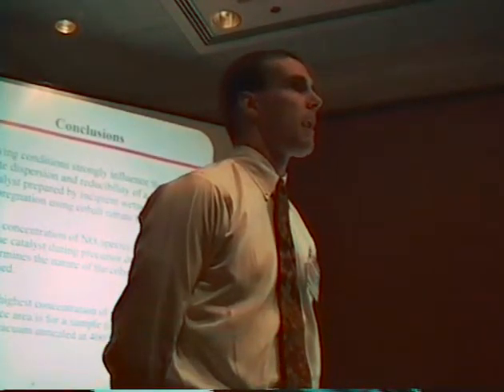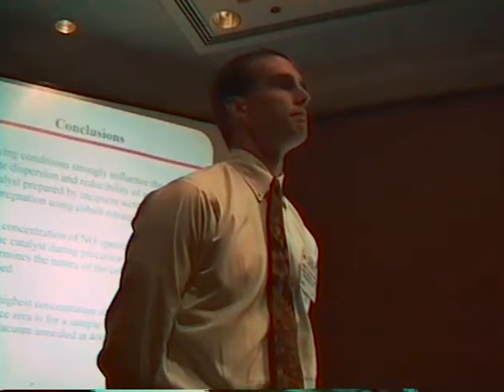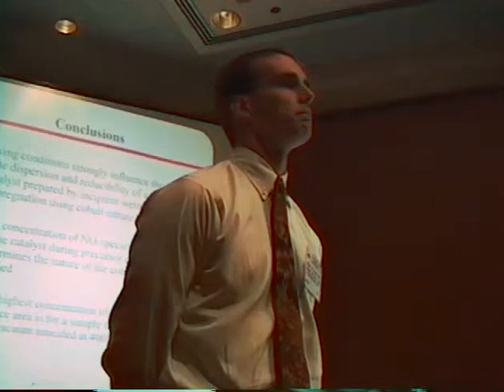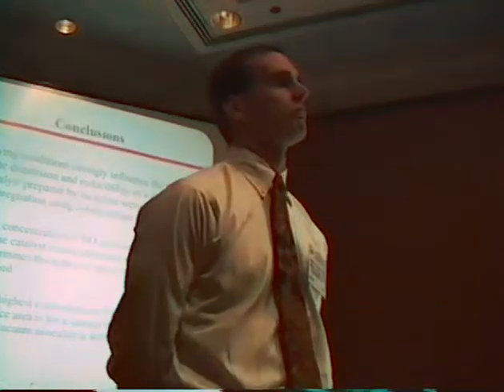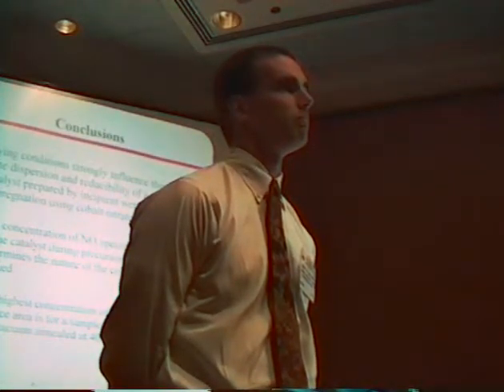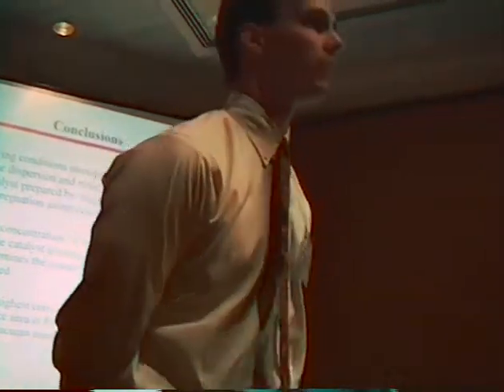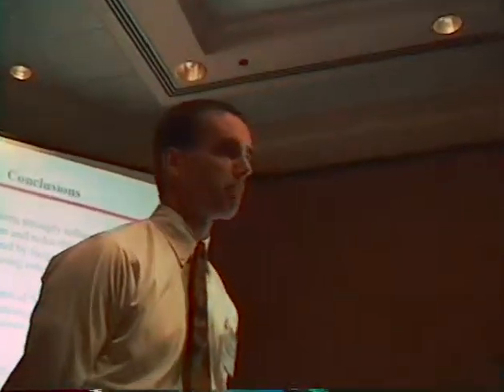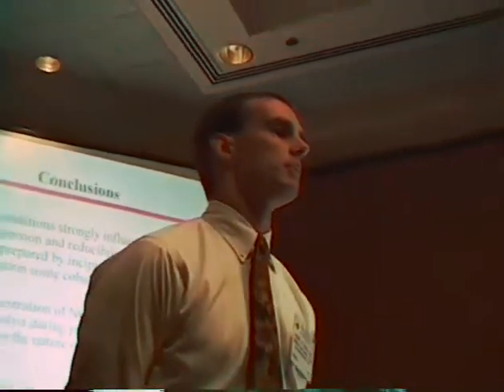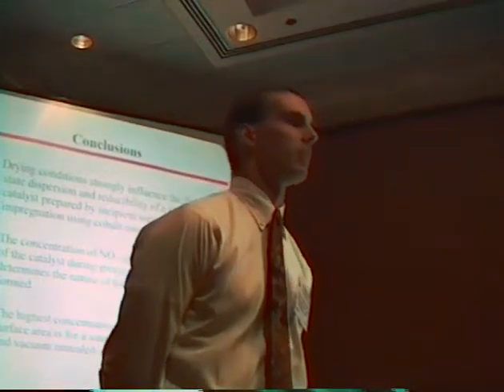Well, the question is, can you completely discount the possibility that in addition to, or maybe in lieu of, the association, I should say in addition to, because you're definitely right, you might have some CO adsorbed in such a fashion that it would be infrared active? No, I agree totally. I feel that there is very possibly CO adsorbed in a way so that it is not IR active. But at this point, we had intended on using IR.